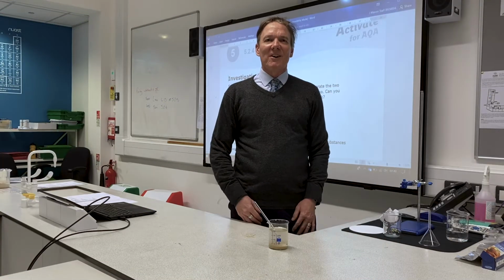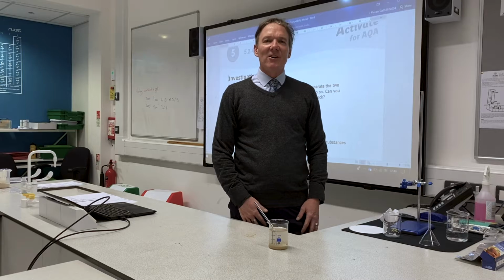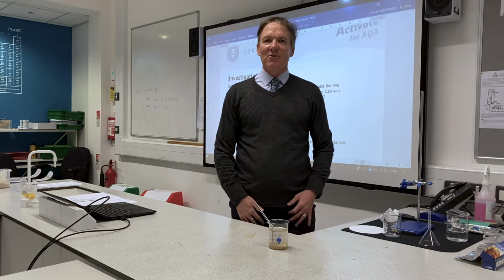To New Apps Practical Science. I'm Dr Woodroffe. Today you're going to learn how to do a filtration.